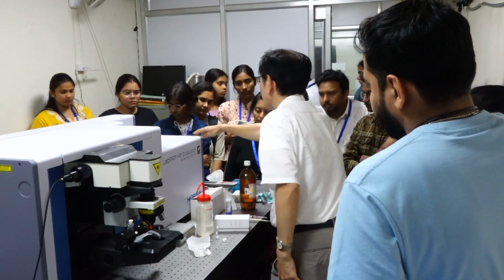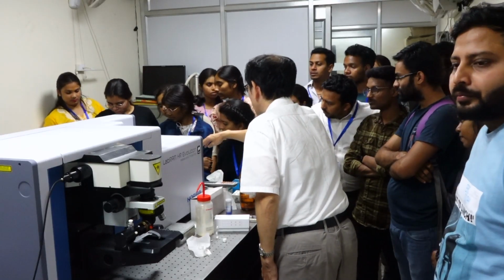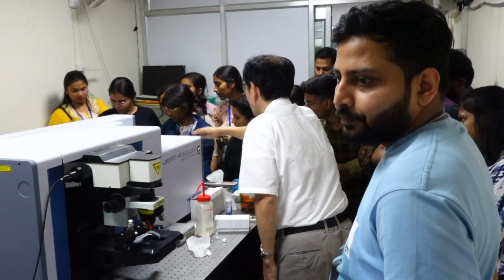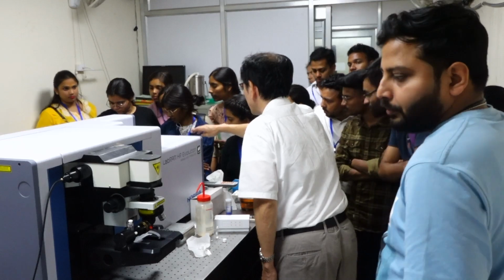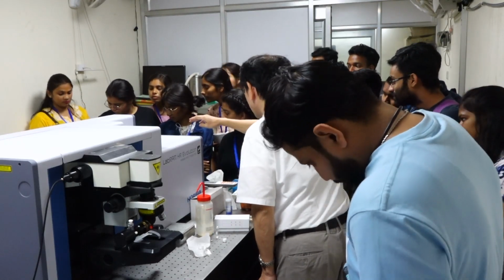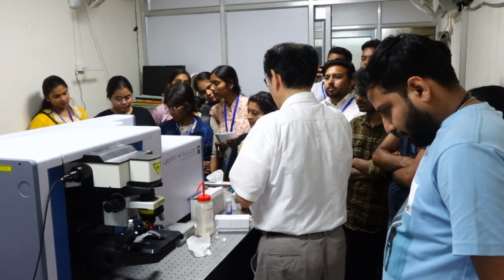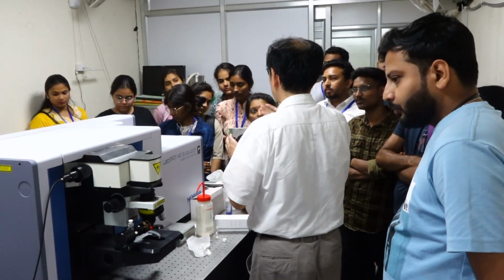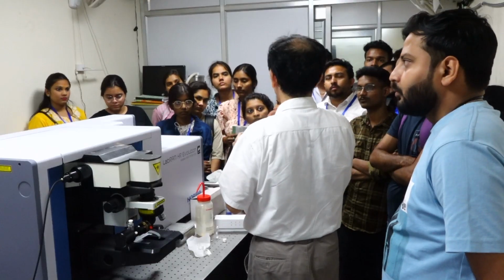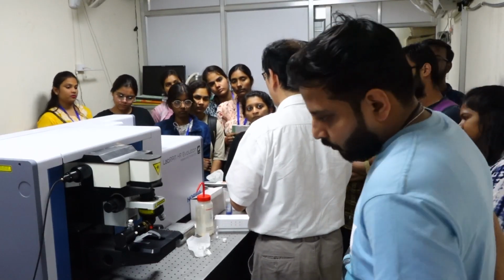So over there is the excitation laser beam. From left 532 green laser, middle is 633 red laser, and right is 785 red laser. When the laser light comes into our naked eye, it damages the eye, and it's very hazardous.